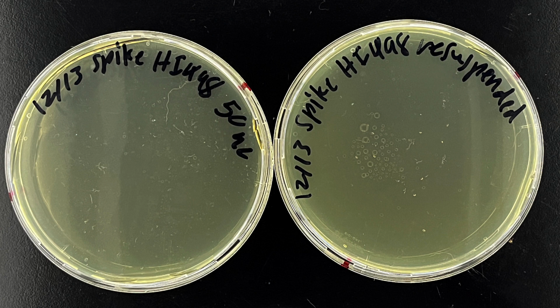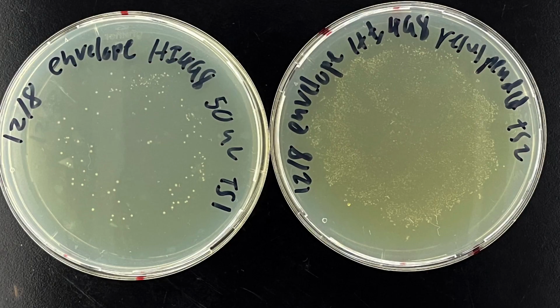So let's look at what some successful transformations will look like. So just to show that Jaden can indeed clone things, this is one of a successful transformation. And those little dots, in case you didn't know what they looked like before, those are colonies. They're mounds of bacteria, and since each of these essentially rose up from one single cell, each of these colonies are what we call clones. They are theoretically unique individuals in this population.